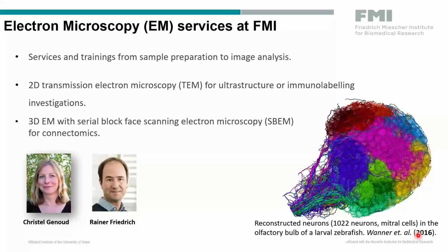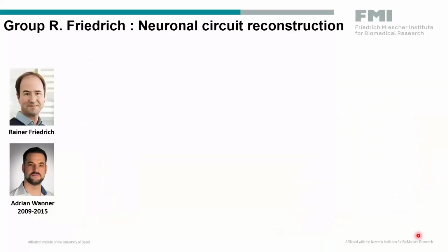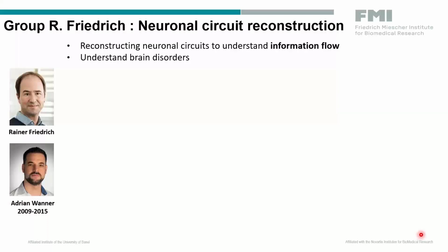The technical expertise in 3D electron microscopy was introduced and implemented by Christelle Genoux together with Rainer Friedrich and his group. Over the years, the technique has been greatly challenged by his scientific questions in Connectomics. For example, the group of Rainer Friedrich wants to understand how the brain processes and computes information. To address this question, they need to reconstruct brain neuronal circuits by combining analysis of connectivity, called Connectomics, with studies of circuit functions and behavior.